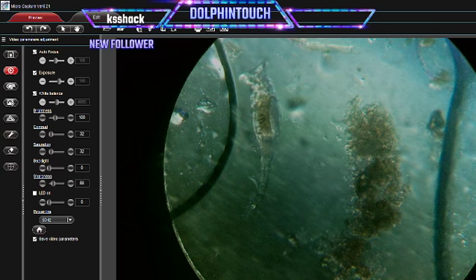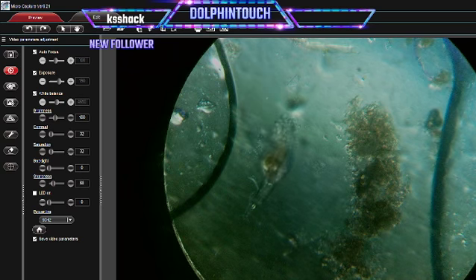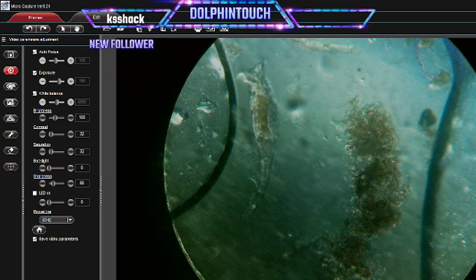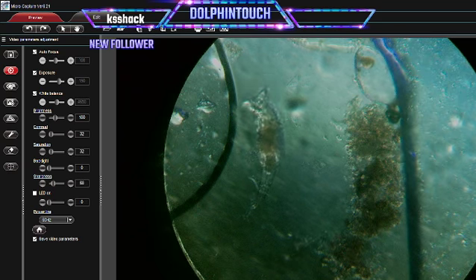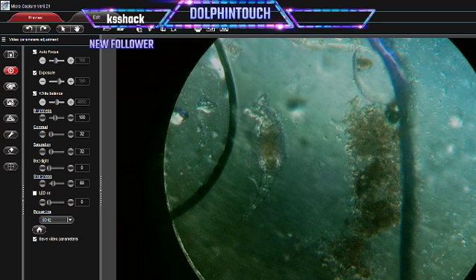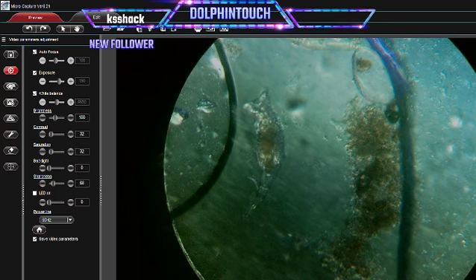I'm going to try to figure out what microorganism that is. We might be able to find it then. And when you look up micro creatures, all they seem to show is the tardigrade. And he's not a tardigrade, I know that. And it's like, wow.